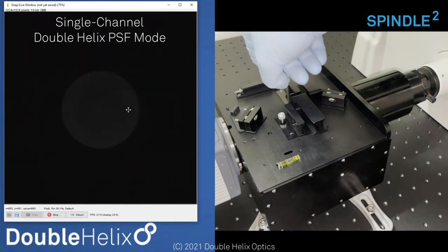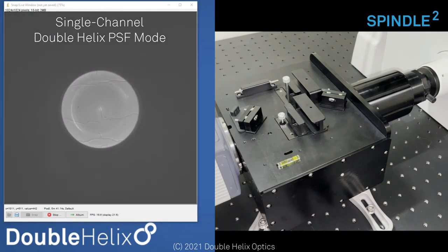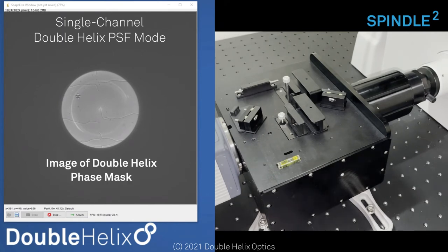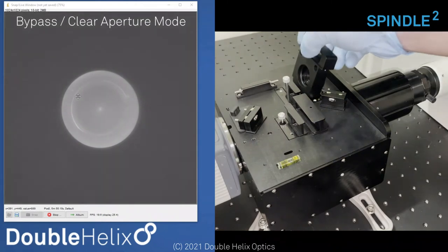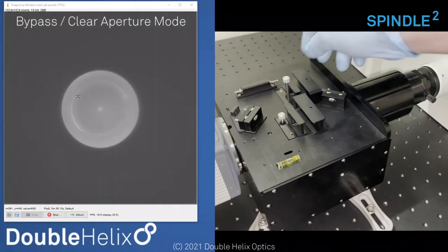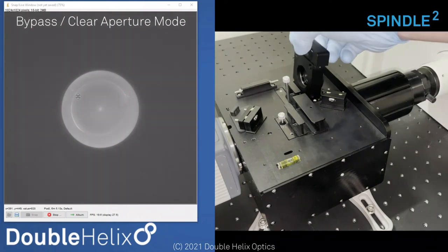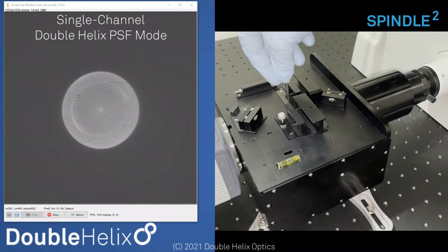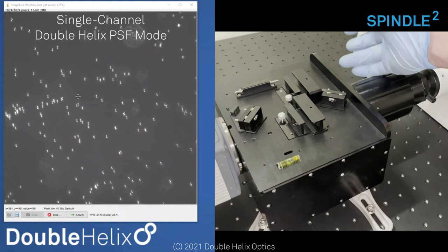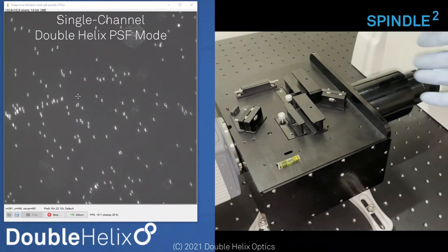We have an alignment lens, so if I pull that up to put it into place and get the microscope settings adjusted, we'll see a really crisp image of our phase mask inserted into the pupil plane — and that's really our core technology. We can pull the phase mask out of place and see that with clear aperture, there's no phase being imposed at that plane. If I pull the blank cartridge out and put the phase mask cartridge back in, we now see the double helix phase mask. We also have adjustment to bring that phase mask in and out of focus, and we use that along with our zoom mechanism to bring the whole system into focus.